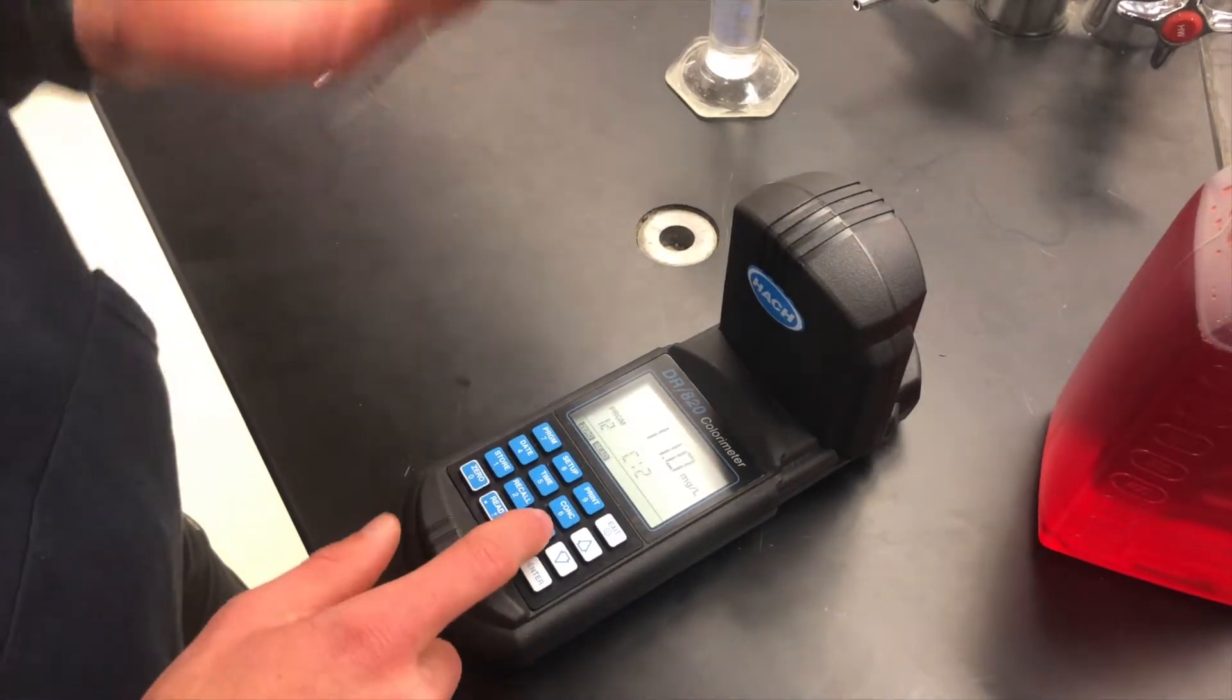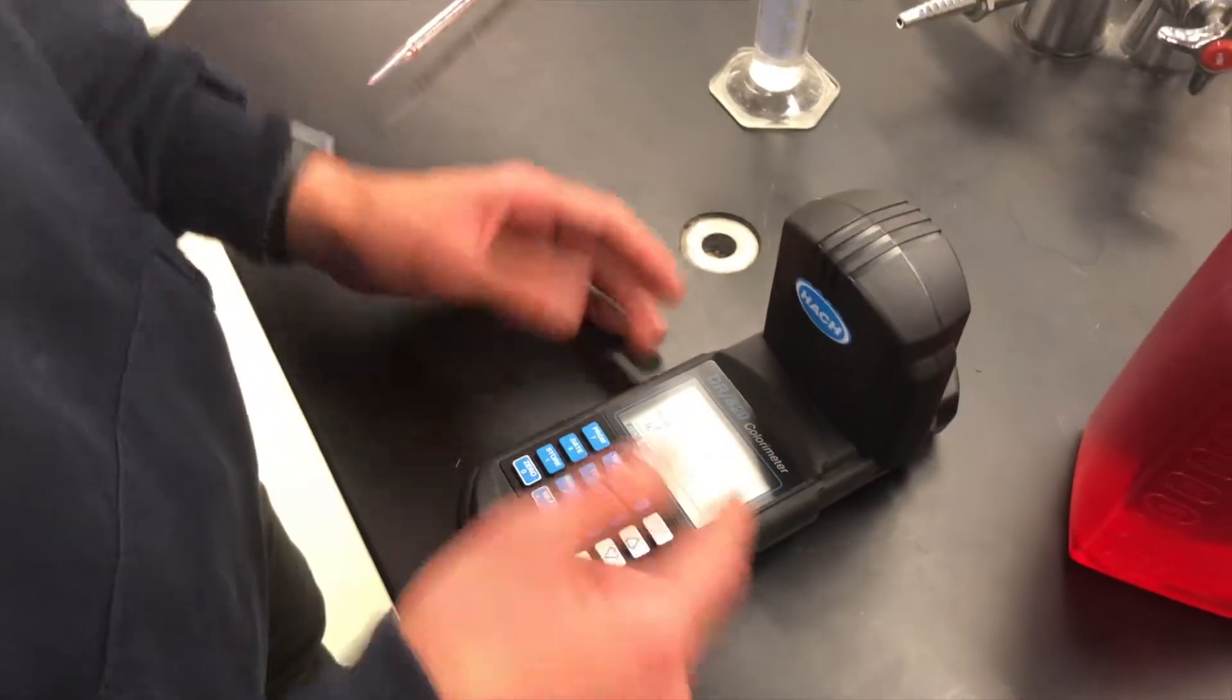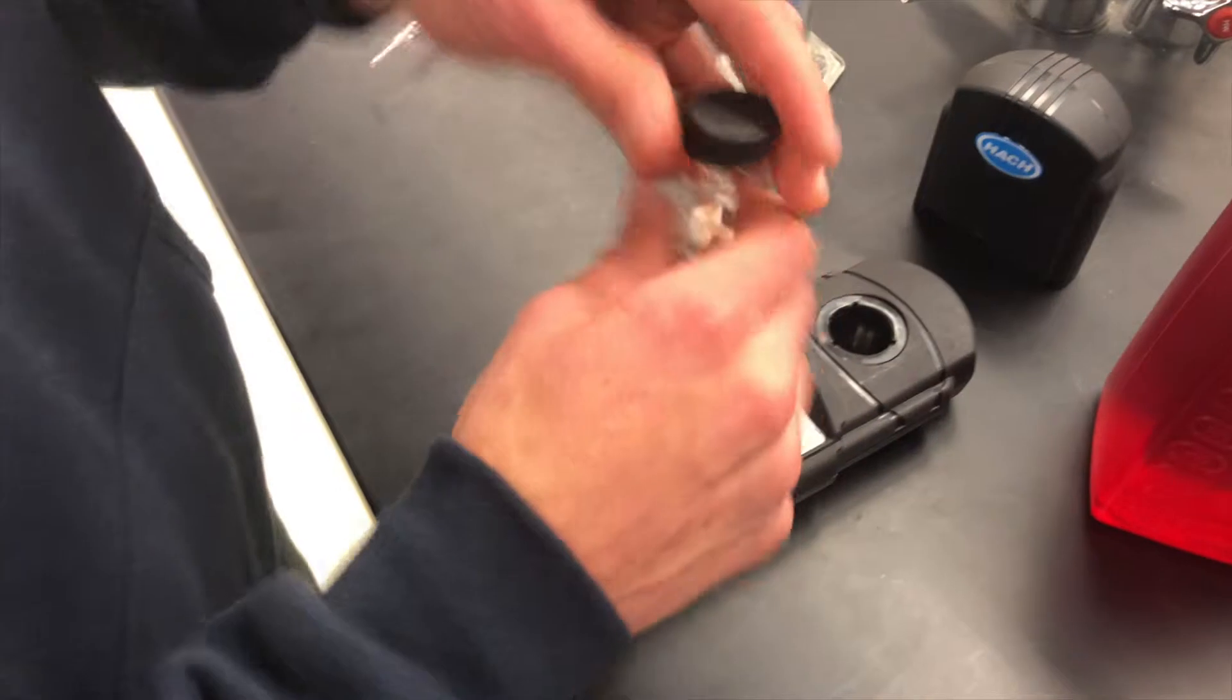This is milligrams per liter, which we don't want. So we're going to switch it to absorbance. Oh, no! Since it's over two, it means it's not a good reading because the Hatch Meter can't read over two absorbance. So we're going to take this out and dump it because it's pointless.